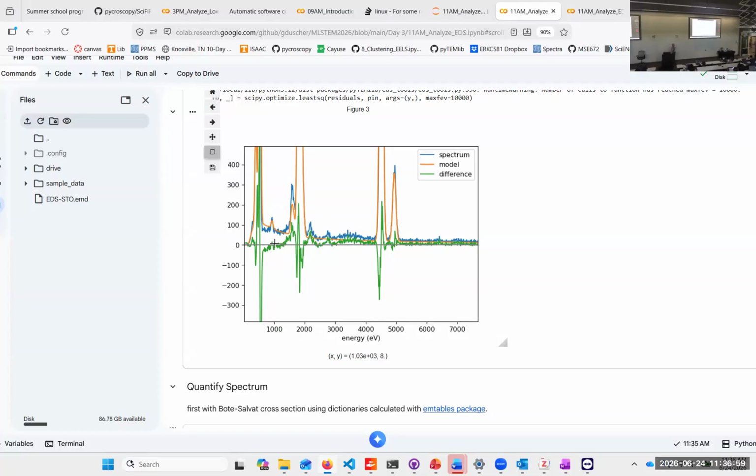So if I see that the titanium, let's say, goes down within a few nanometer, then this defect grain boundary interface is titanium deficient, except if it's right next to something heavy.